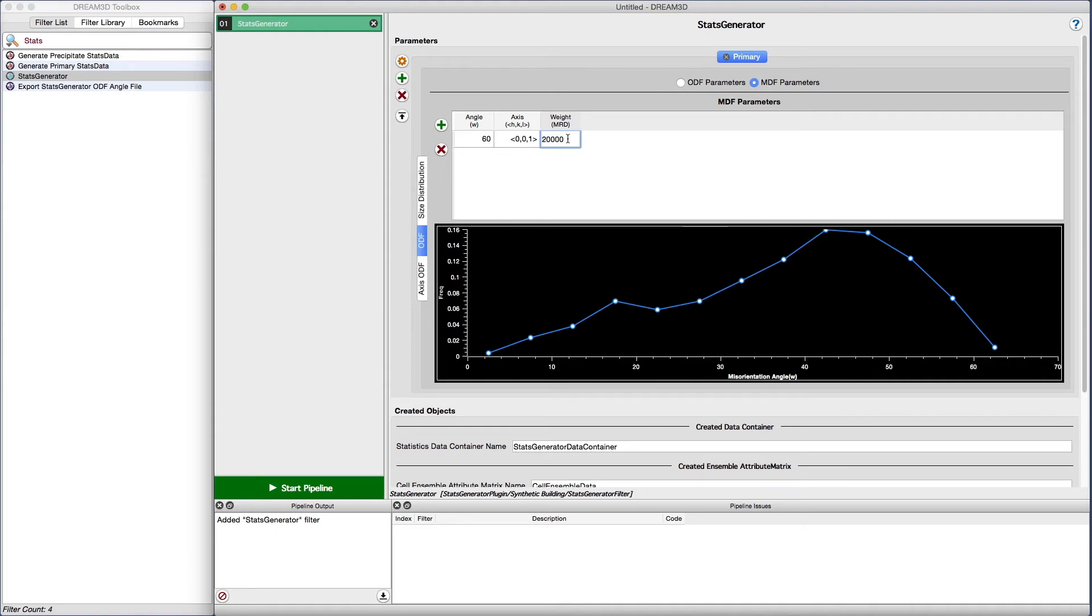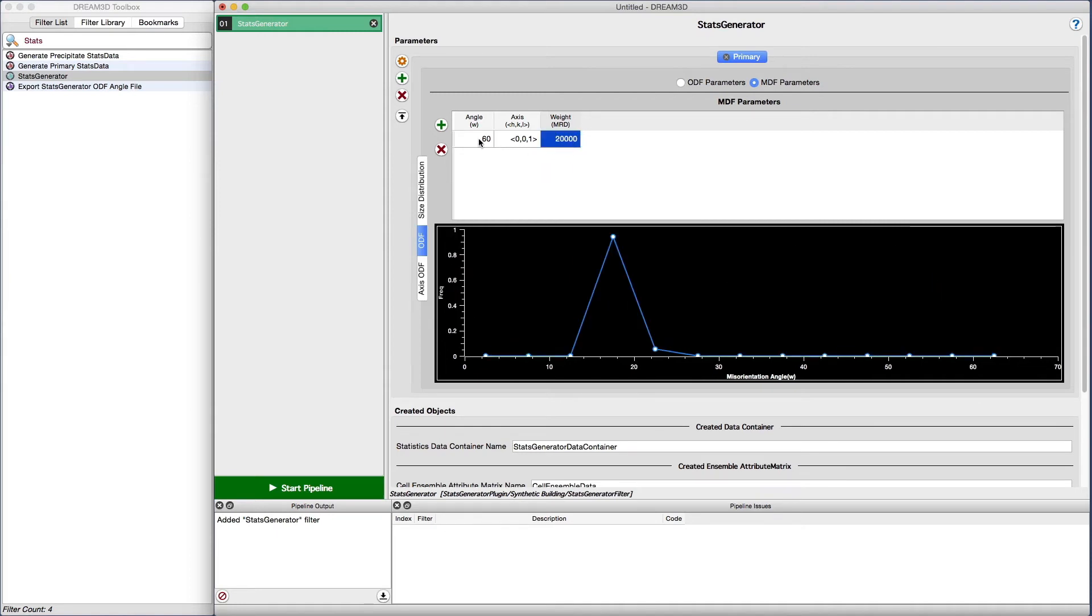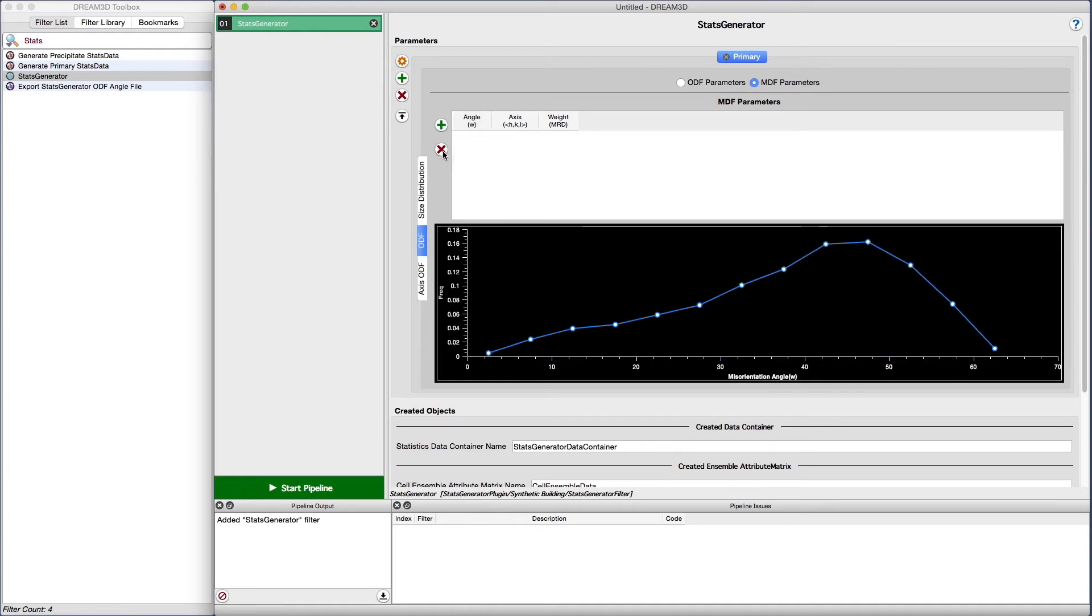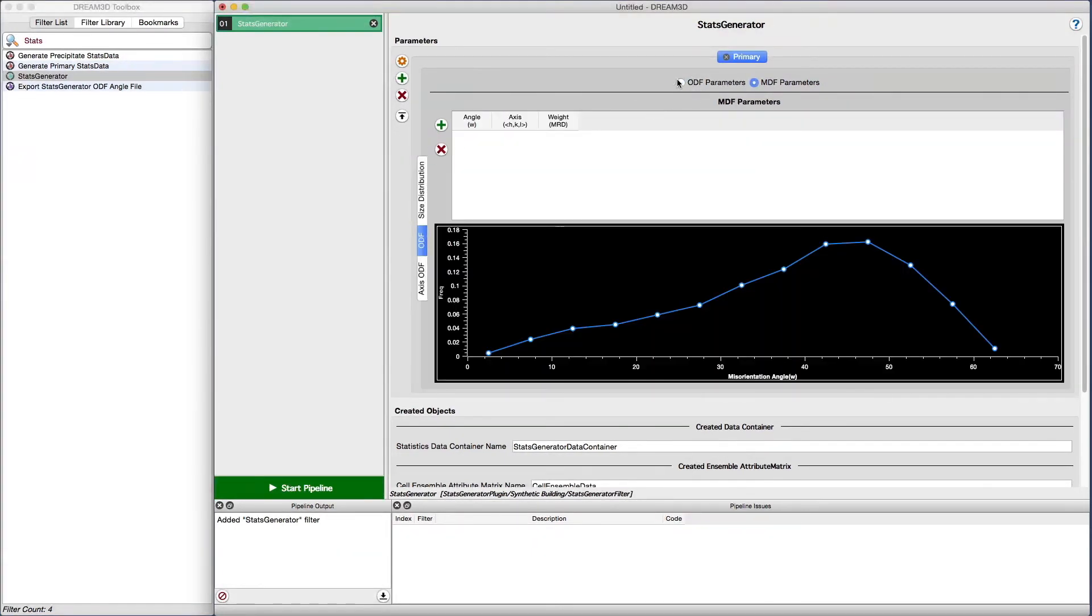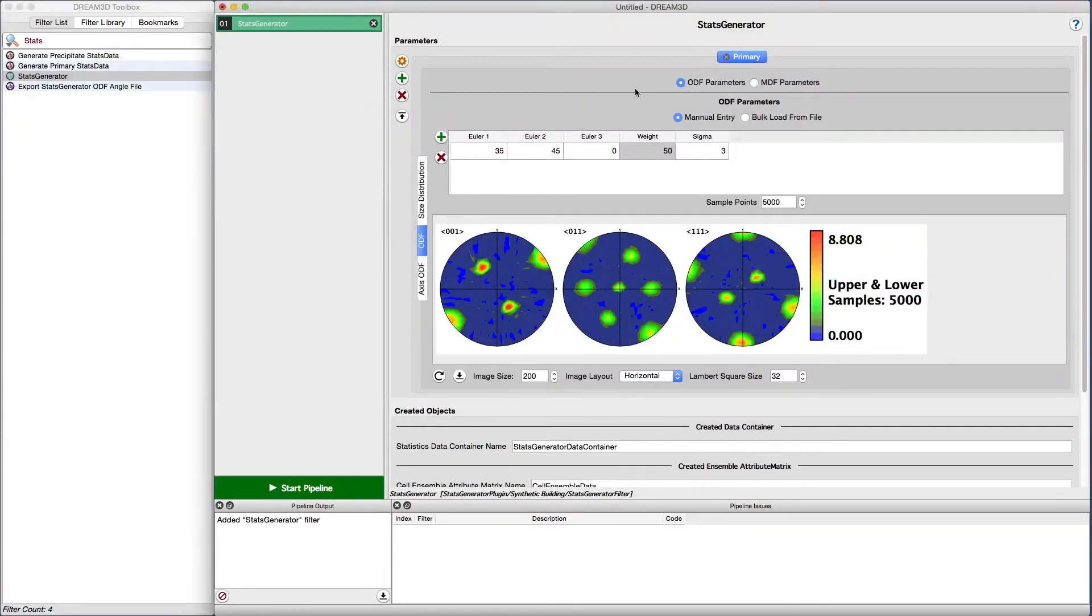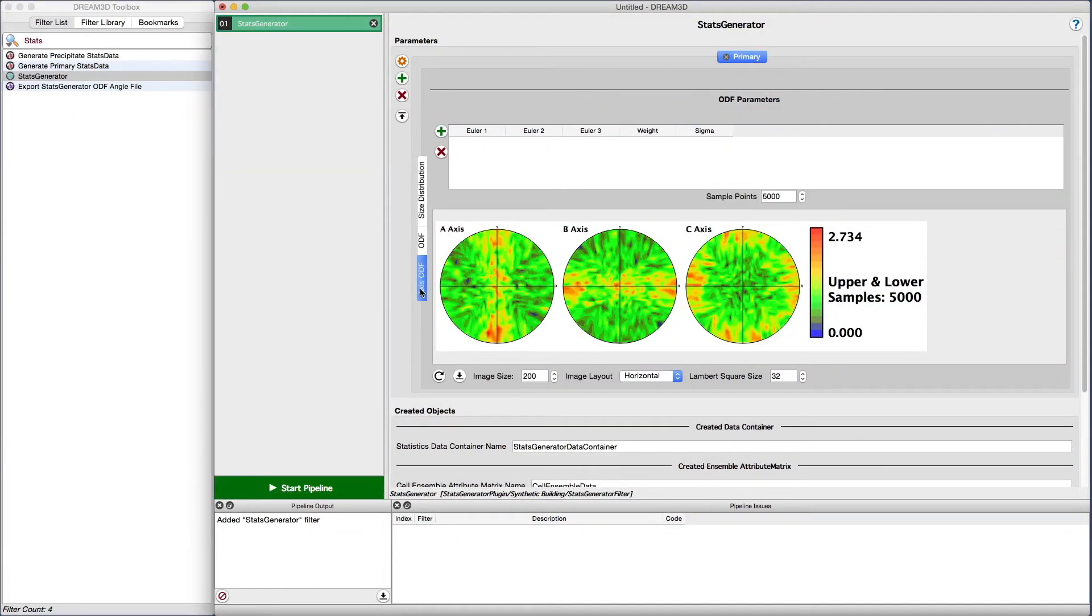Adjust the angle and degrees, the axis, and add a weight value. Note how the plot will update itself as you enter the values. To remove a row, select the row and click the delete MDF weight button.